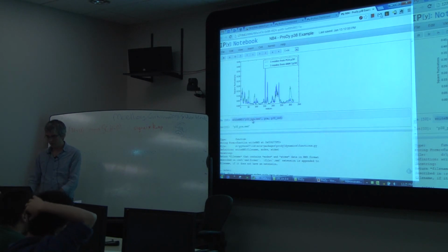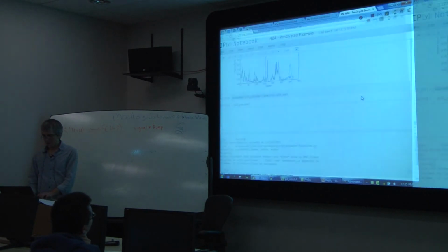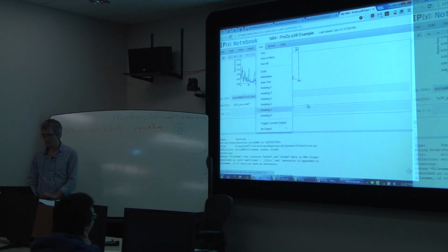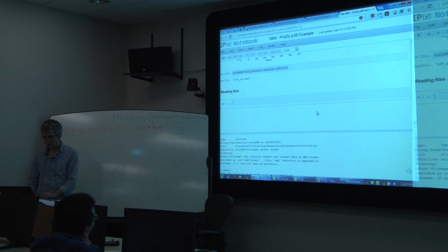So I will write this, but this is going to write 20 modes now. Instead of writing 20 modes, probably I will want to analyze the top 6 modes. I can make a slice of the PCA object, and I will end up writing just 6 modes. I didn't show you, but maybe here I can show you writing a file or reading a file. You can open a file for reading with the built-in open command. We will read this file now and print the things in it onto the screen.